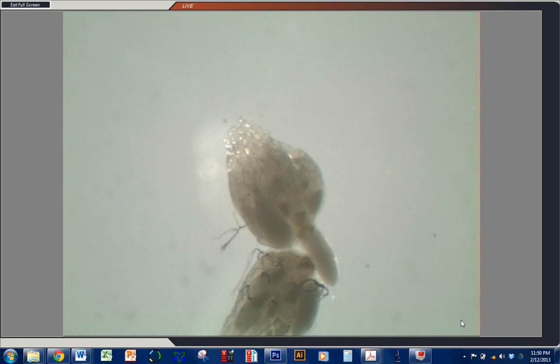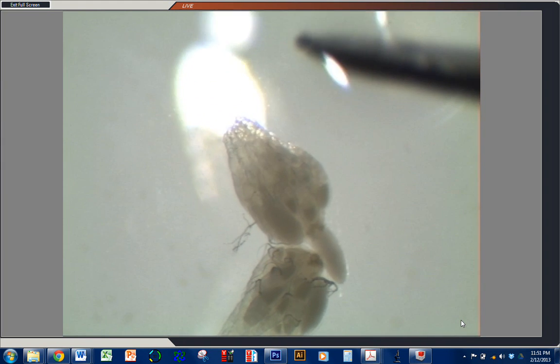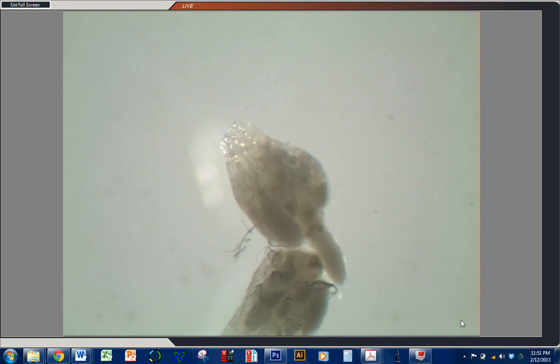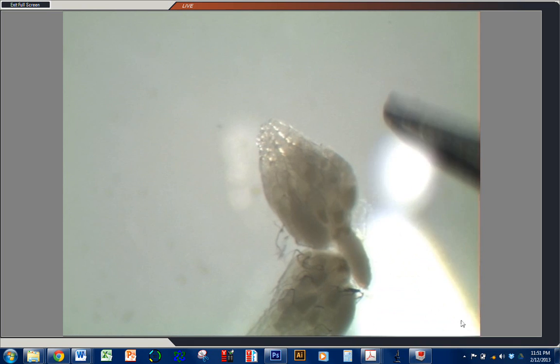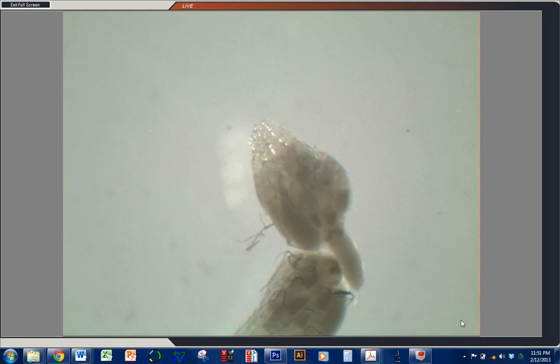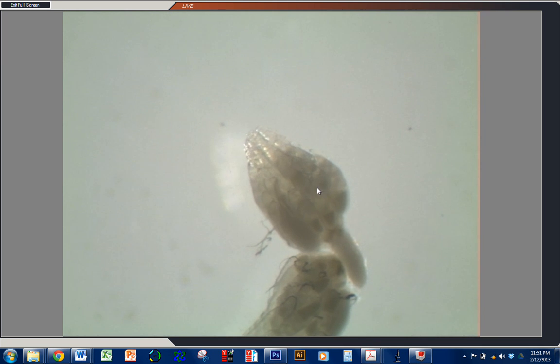Up here where it's a bit more translucent — this is the early stages of oogenesis where vitellogenesis, that is the production of yolk, has not yet occurred — so they're fairly transparent. As you move posterior towards the more mature egg chambers back here, you can see it becomes a little more opaque. You can actually make out individual oocytes; this is an individual oocyte within a larger egg chamber within an ovarial.